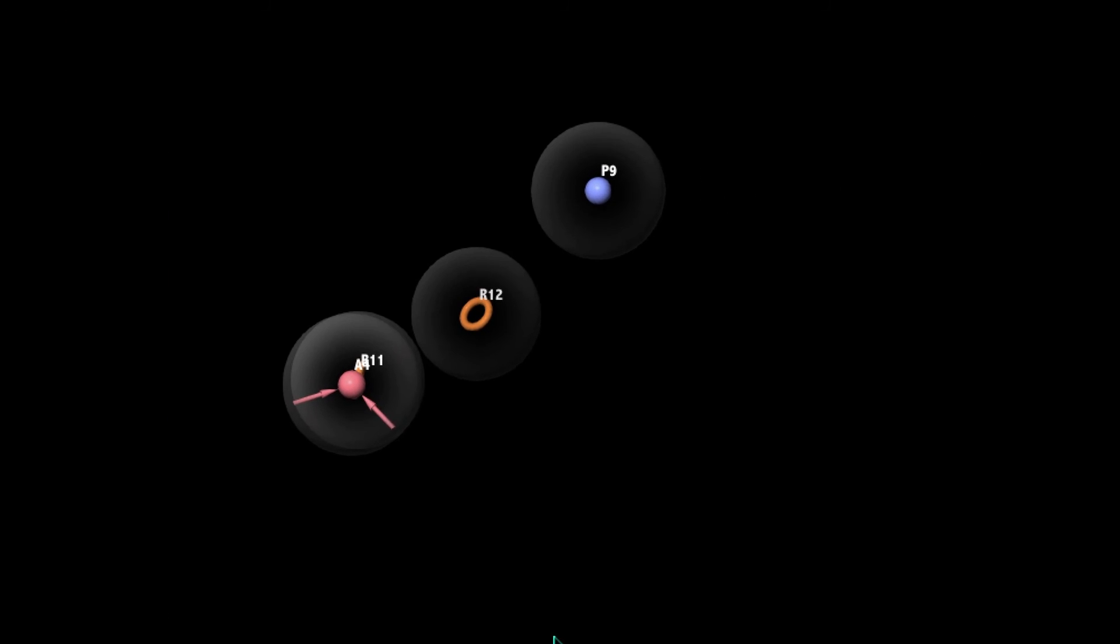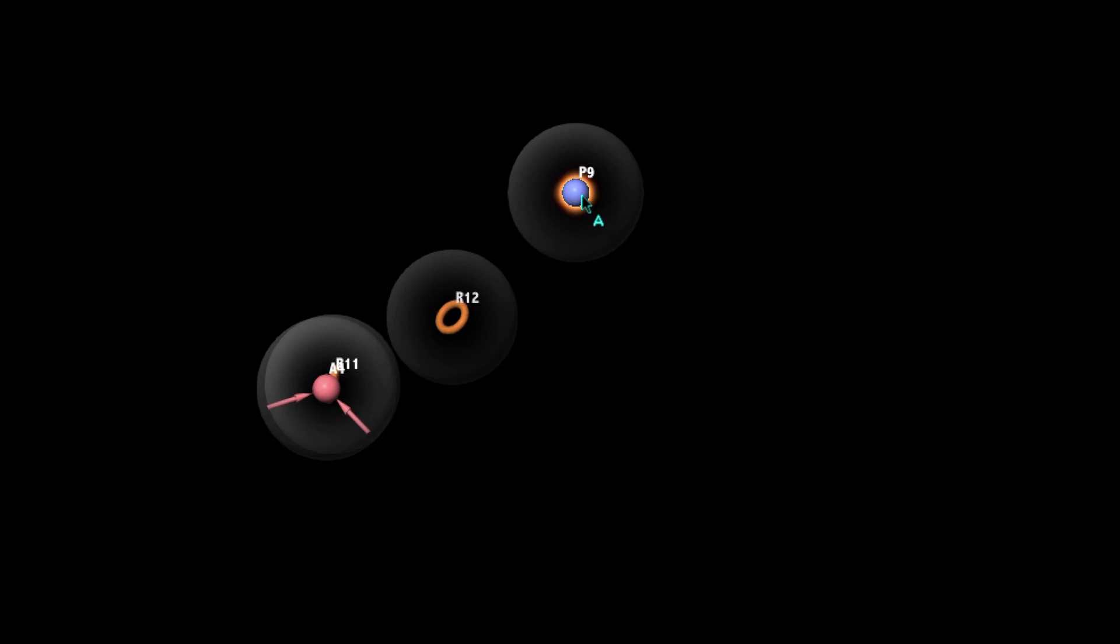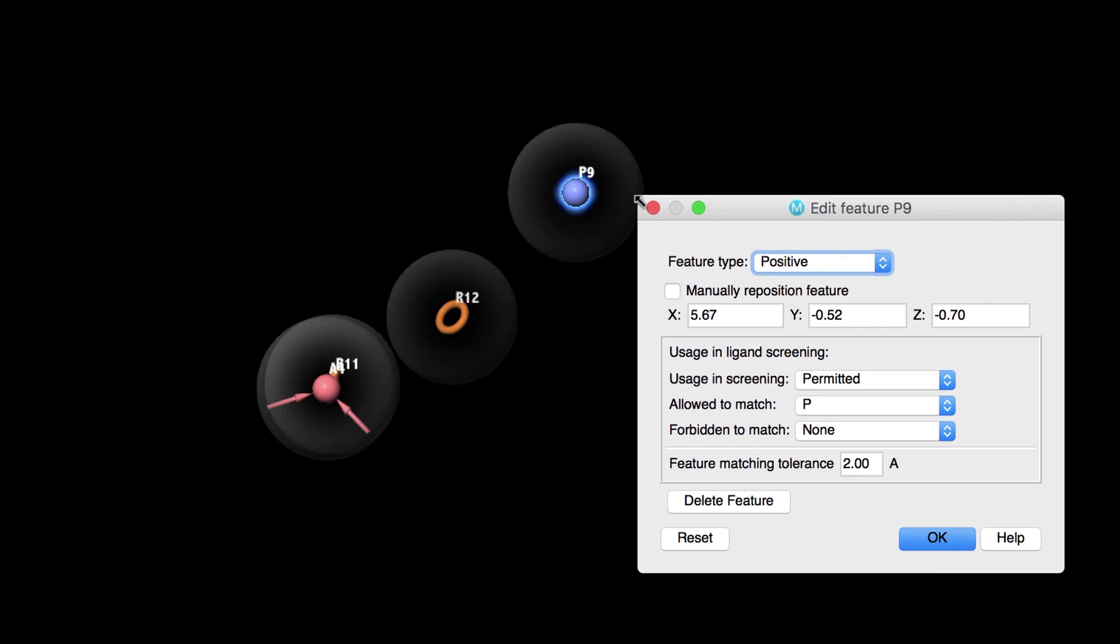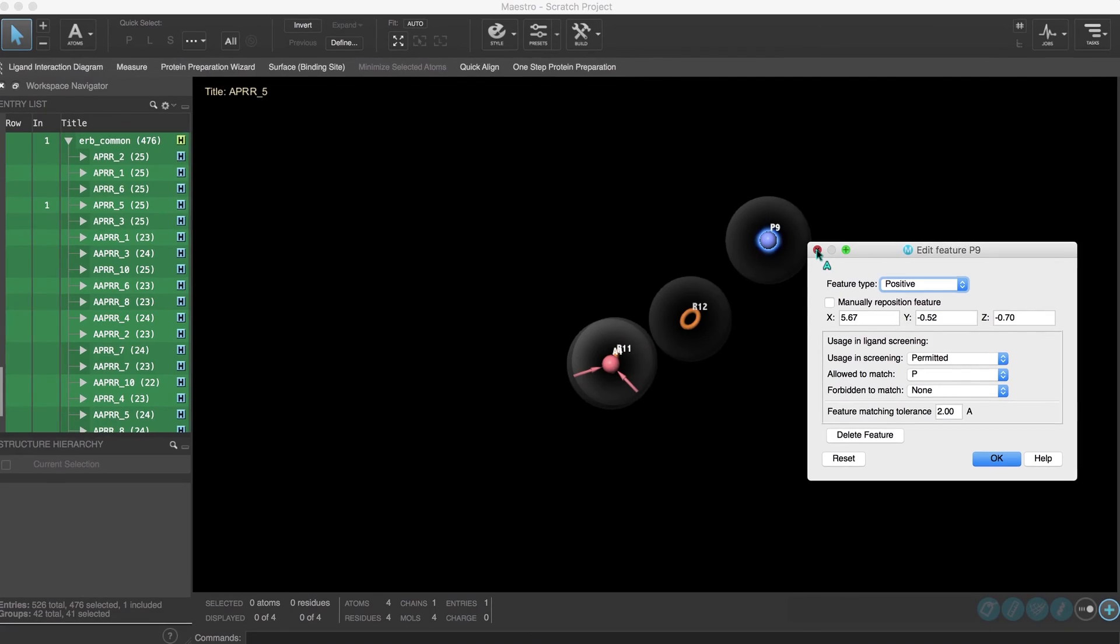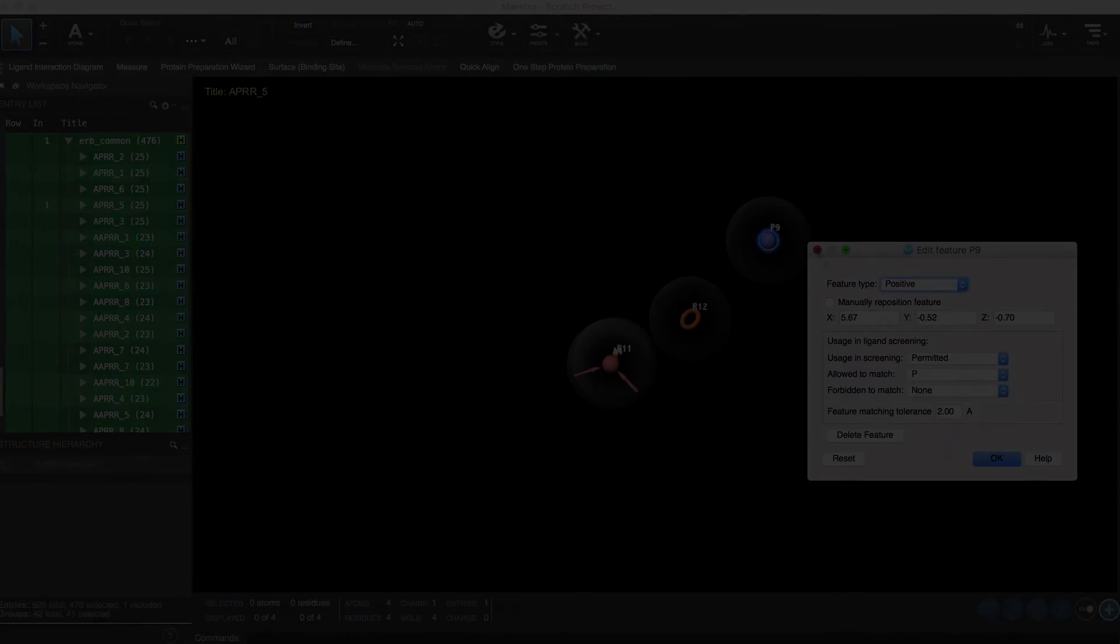Finally note that right clicking on a feature in the workspace also reveals other options for feature editing. We'll discuss more about these topics in future videos so stay tuned.